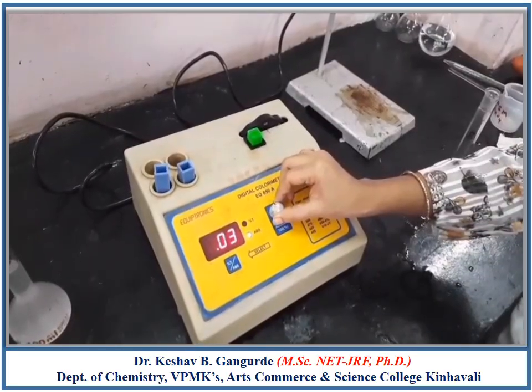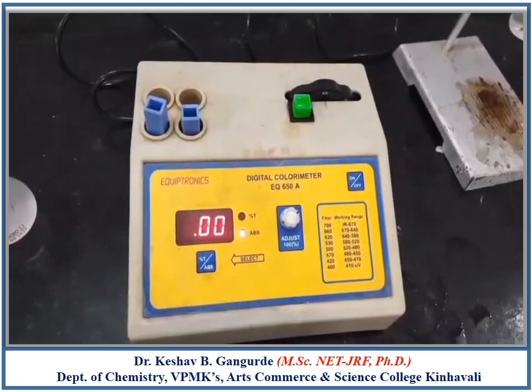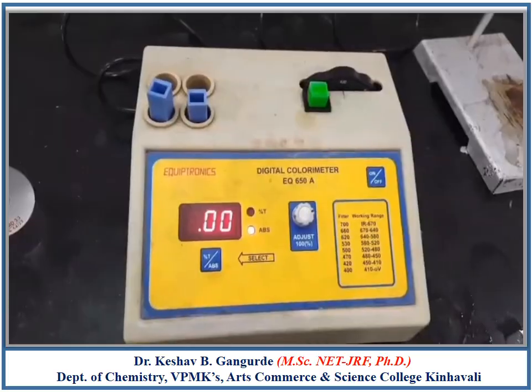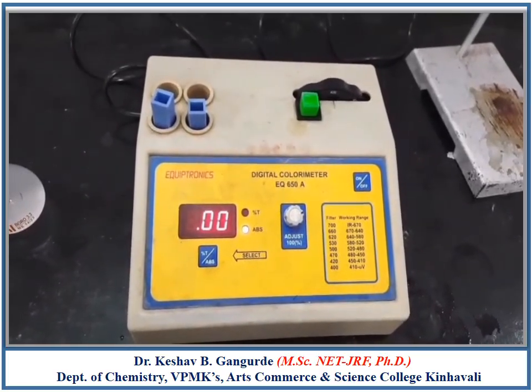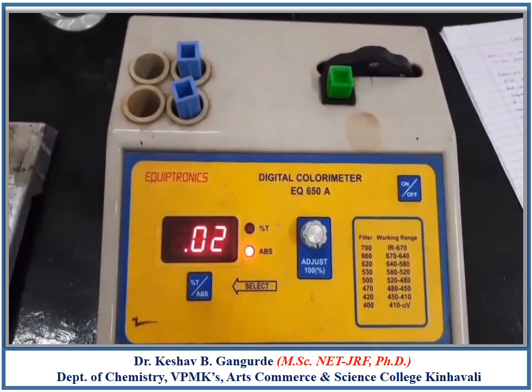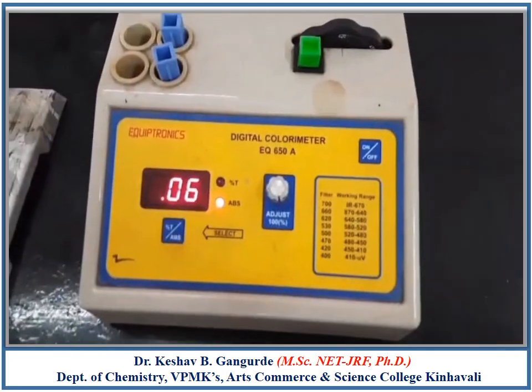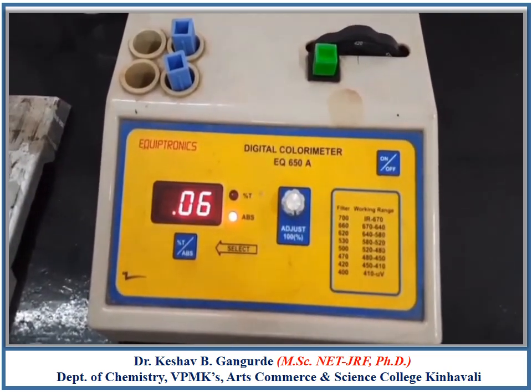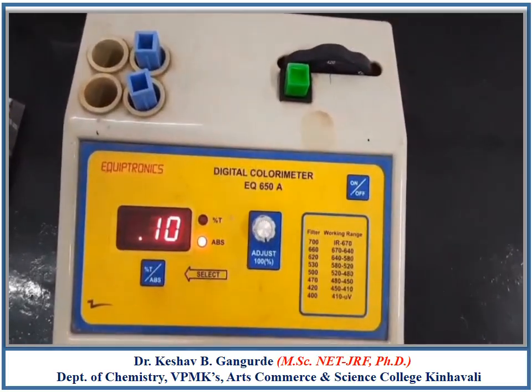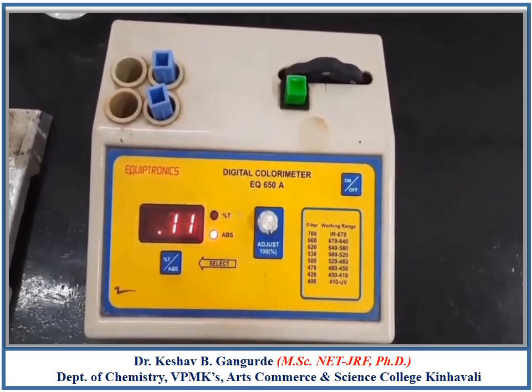Select the 420 nanometer wavelength filter on the colorimeter and perform standardization using the blank — adjust 0 absorbance using the blank. Then measure the absorbance of all standard solutions. The absorbance readings are: 0 for blank, 0.02 for 5 ppm, 0.03 for 10 ppm, 0.06 for 20 ppm, 0.1 for 30 ppm, and 0.11 for 40 ppm.